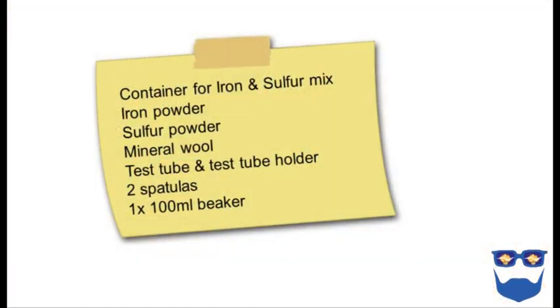Here's a suggested technician's list for this experiment. A mixing container, mine's labeled iron plus sulfur mix. Iron powder, sometimes this might be called pin dust. Sulfur powder. Mineral wool. Test tube. A test tube holder. Two spatulas to avoid contamination. One 100ml beaker. I'm presuming you have Bunsen burners and heatproof mats in your lab.